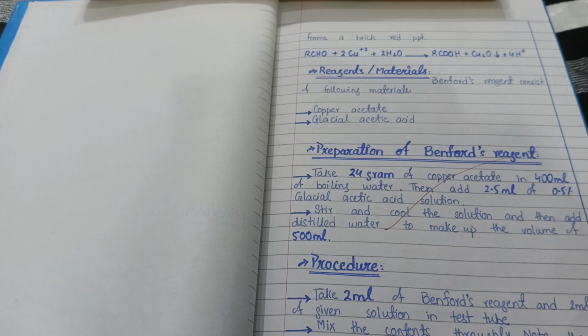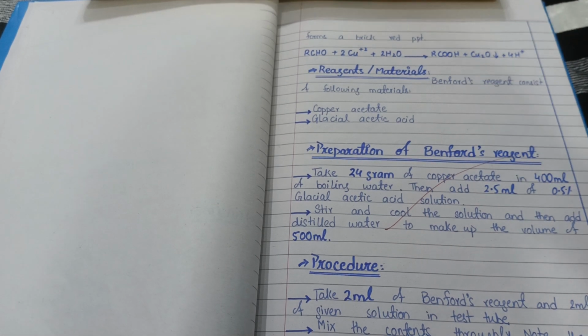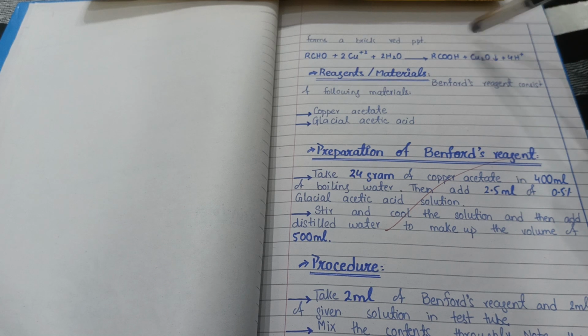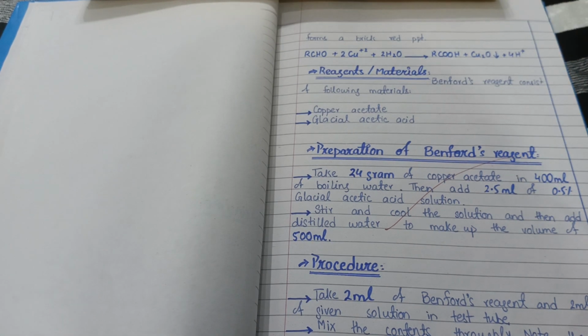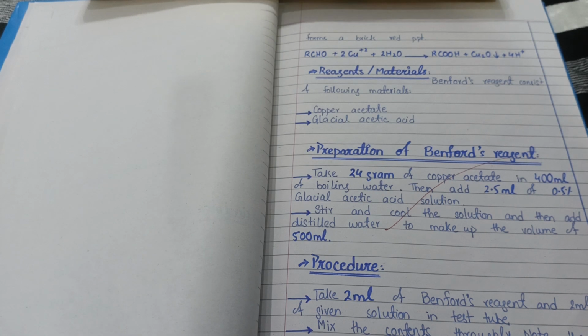So why does your red ppt appear at the bottom? This is due to this ion, the cuprous oxide. It has the color of a brick red ppt. So whenever your sugar reacts with the cupric ion, it produces cuprous oxide, and this is the reduction reaction. Now the reagents used for this experiment are cupric acetate and glacial acetic acid.